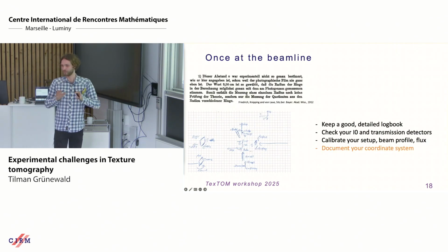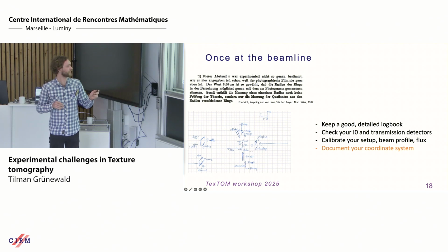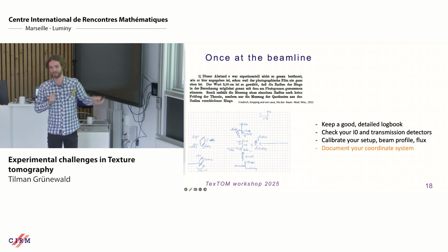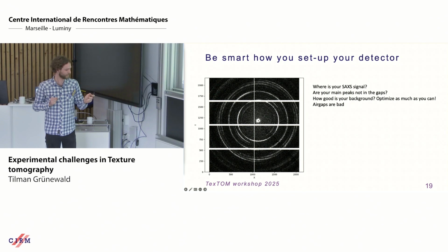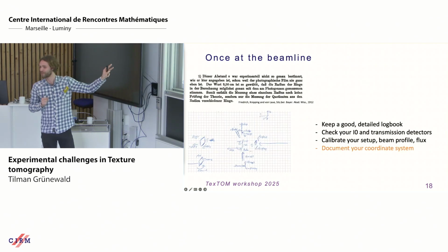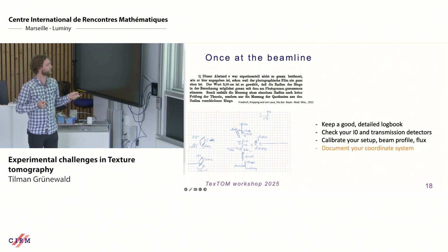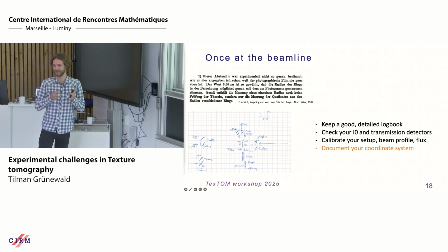Once you're at the beamline, once you start, keep a detailed logbook. I mean, in the preparation of this workshop, I was actually looking at the earliest paper about X-ray diffraction from Friedrich, Knipping, and Laue, and they make a note about the sample detector distance, that they had trouble determining it. So it's an old problem. Keep a good logbook, sketch out the geometry. Figure out in which way a motor moves.